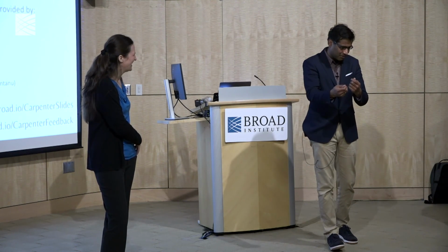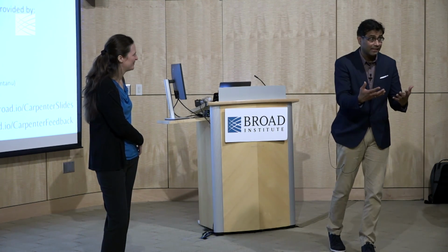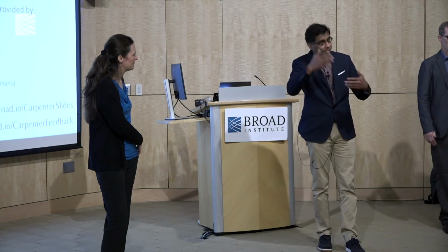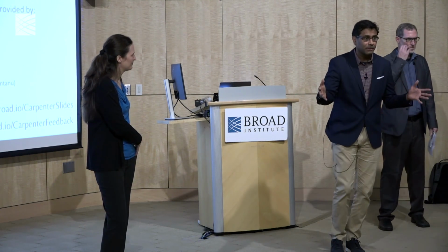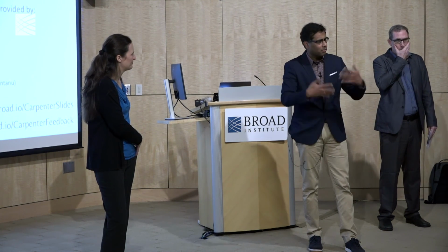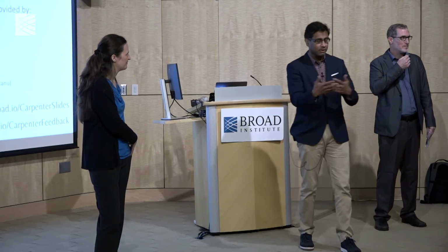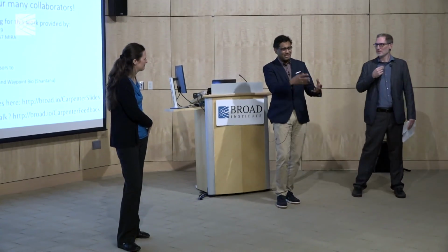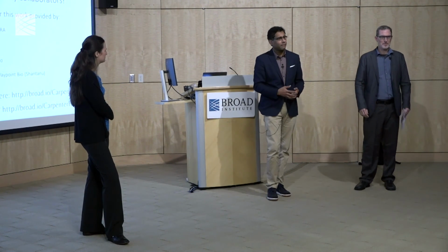But the other aspect of it was also that, to some extent, you want some sort of sanity check that you can see the phenotype. But as you go more and more multidimensional, multi-channel, now you can do screens with 20 markers, right? At that point, when you're looking at a 20-channel image, you have to rely much more on the statistics. No doubt human expertise should be baked into trying to go from the image to the biology, and that's important. But at some point, that does break down.